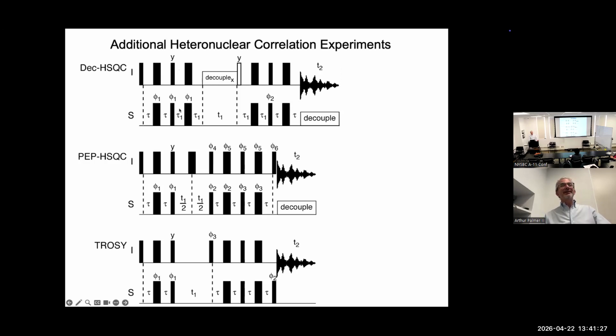So when you build these into longer sequences, sometimes you can do this trick without complicating the experiment more, in which case it can be kind of for free, that then you can lock yourself with the in-phase operator and gain some resolution. So it wouldn't be so common to do this just as an HSQC because of the extra relaxation losses.